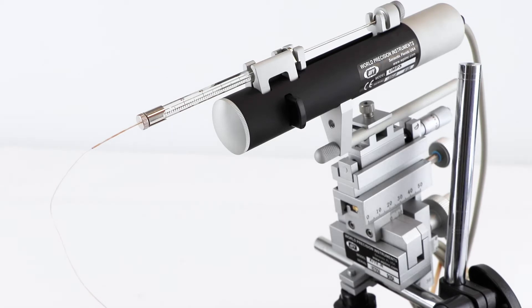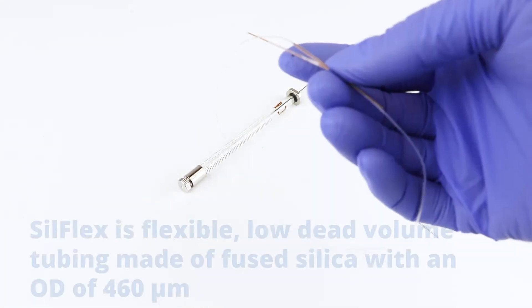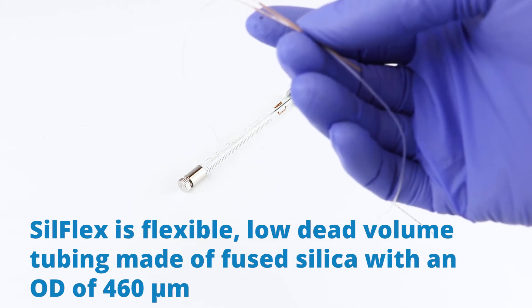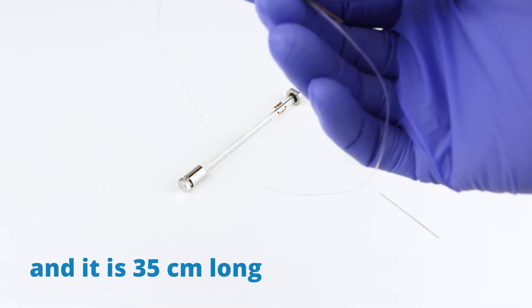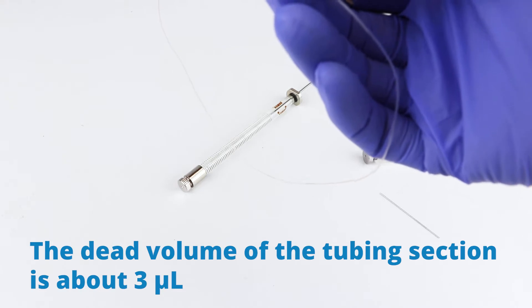Today we're going to talk about how to set this up. This is Silflex, a low dead volume tubing made of fused silica with an outside diameter of 460 microns and it's 35 centimeters long. The dead volume of the tubing section is about 3 µL.